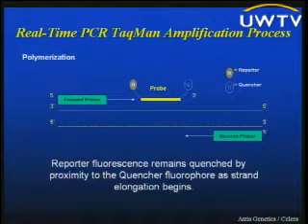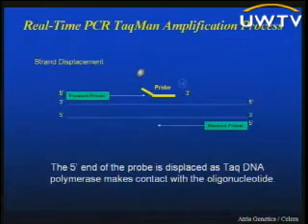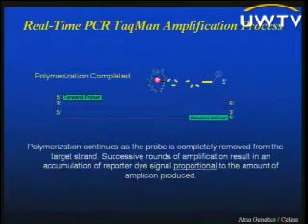And so if you just have the reaction sitting in a tube, nothing is happening because there's no fluorescence to be detected. If you start the PCR reaction and your probe is actually not perfectly hybridized to your chromosomal DNA of interest, because it does not recognize its cognate sequence, so it's kind of flying a little in the breeze, one might say, as the Taq polymerase comes along, polymerizing in the 5' to 3' direction, it sees this probe that's floating around and just kicks it off. So when it kicks the probe off, the reporter as well as the quencher still remain in close proximity to each other, so there's no fluorescence. So unless the probe is sitting flush on the DNA and is recognizing the sequence perfectly, you do not get fluorescence at all.